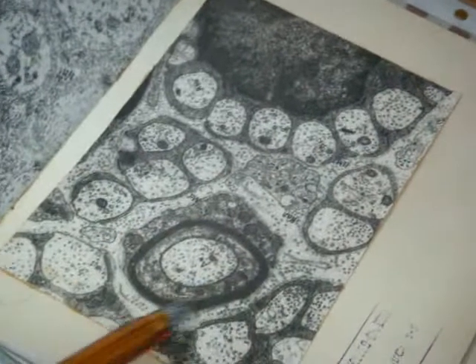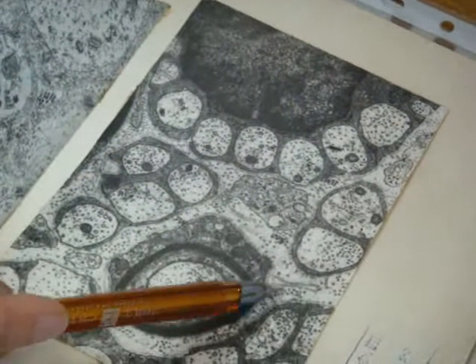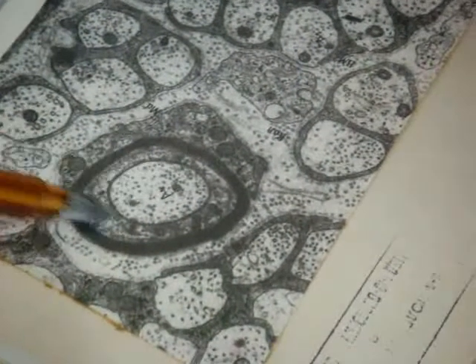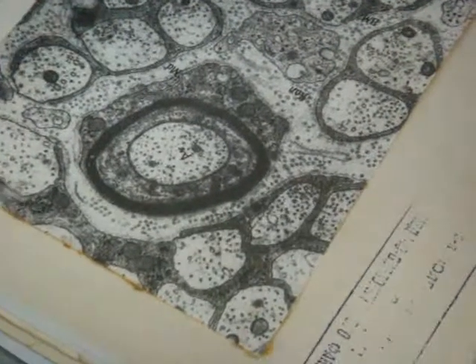This is a cross section through the myelinated nerve fiber and unmyelinated nerve fiber. Between them we can see collagen fibers. Here is the axon, external mesaxon, internal not visible. It does not matter.